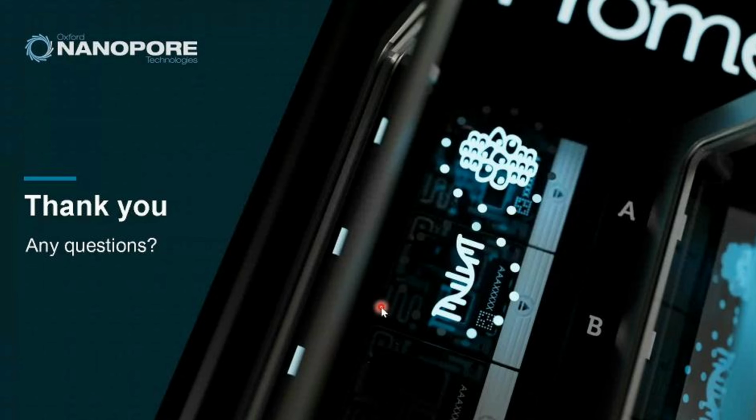But for this kind of fermented food, there will possibly be remains of the food DNA, I mean the plant DNA, there. Therefore, if you're not doing any culturing or enrichment step, PCR will always be the best approach to amplify the DNA from the microbes of interest.